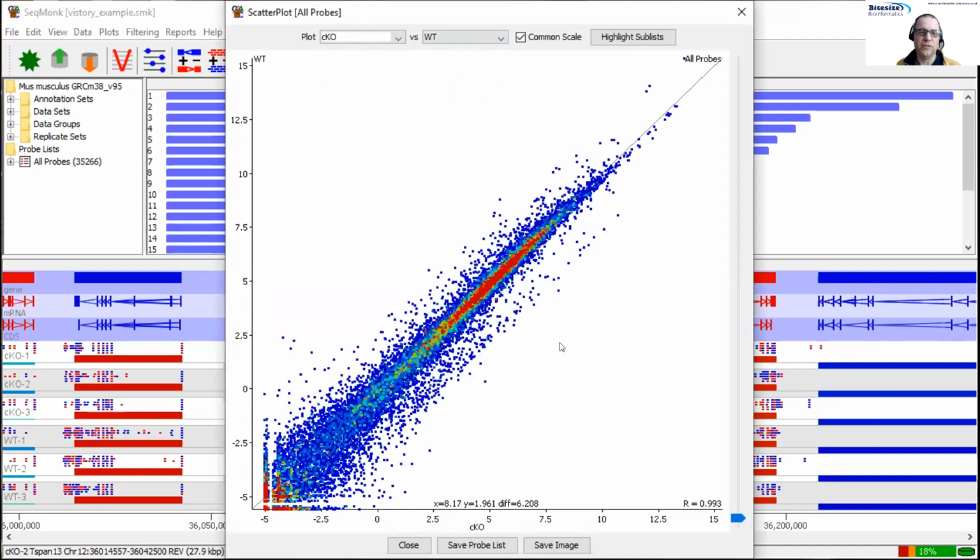But the disadvantage is that the flexibility from being able to try all this stuff can sometimes mean that you can spot things or figure things out, but you don't have a nice rigorous way to record that or share that with other people. And Vistories aim to try and solve that problem.